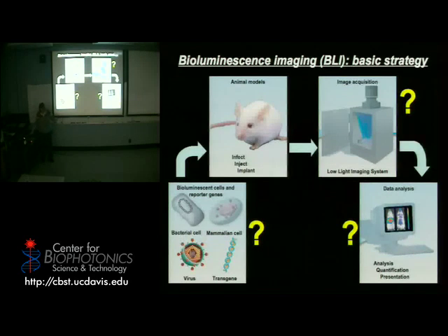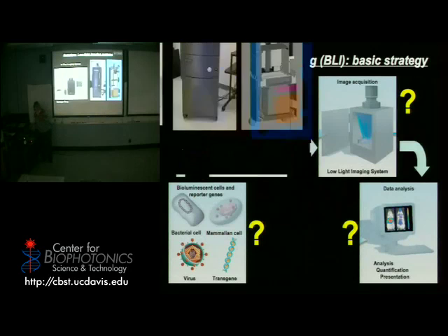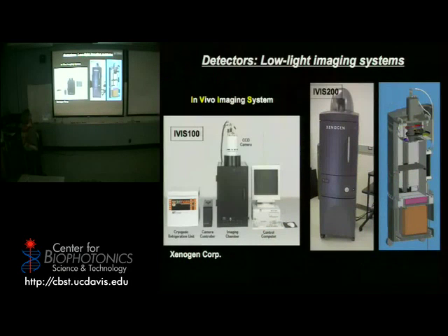Now the instrumentation that's actually used to collect luminescent light from these animals, I'm showing you here. These are sort of cool systems that are nothing more than a glorified black box, right, to stick the animal in so that there's no stray light from outside coming into that animal. And they have a really, really sensitive camera on the top that's cooled with liquid nitrogen and everything. So every photon coming out of that animal, every little piece of light coming out of there, is going to be captured by the camera.